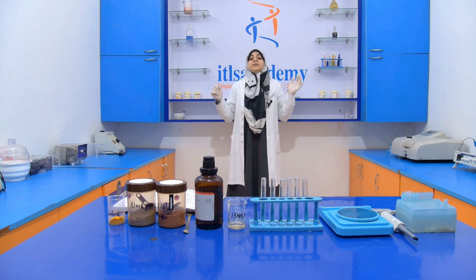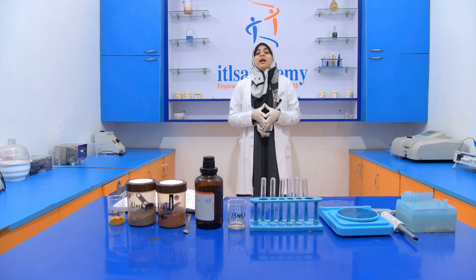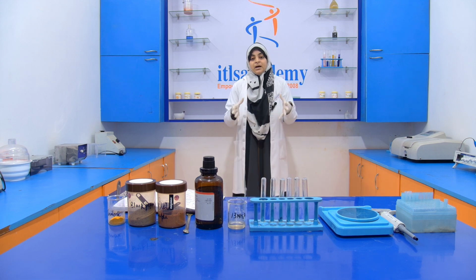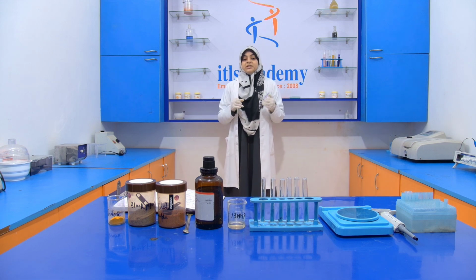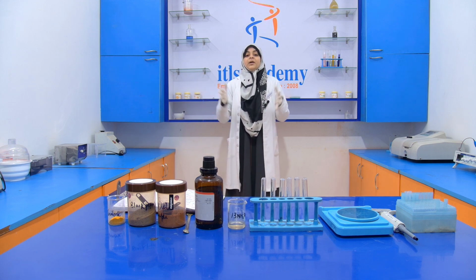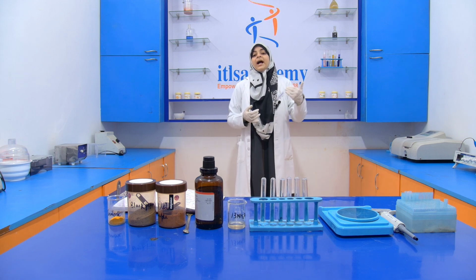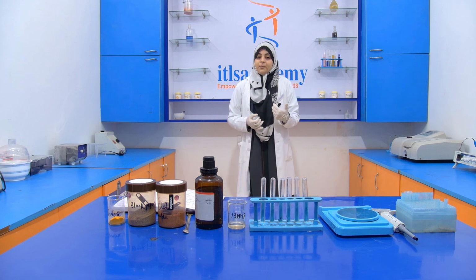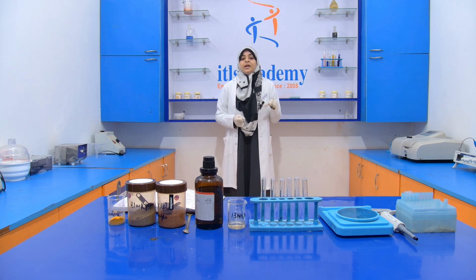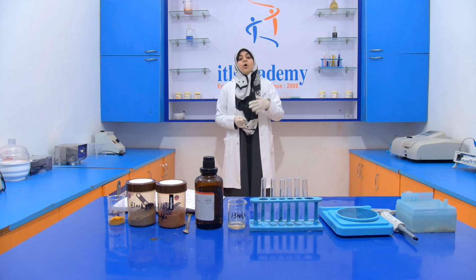Many artificial colors are prohibited, we can't use them, and the level of artificial color we can use for a given amount of food product is also decided by the FSSAI. If we use beyond that limit, then it comes under an illegal process. So that's why it is very important to detect whether our food contains any added color or not.